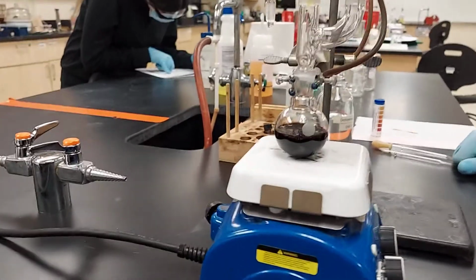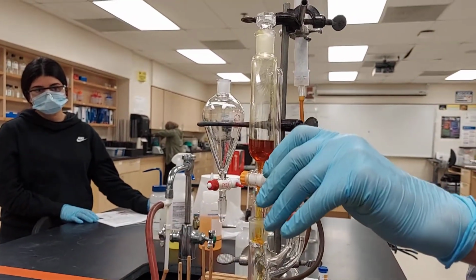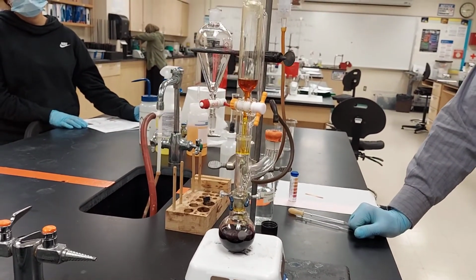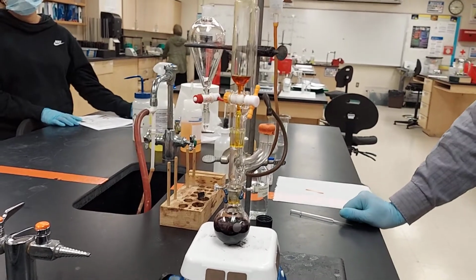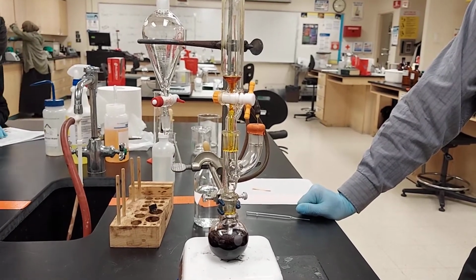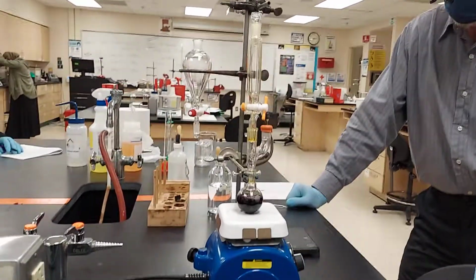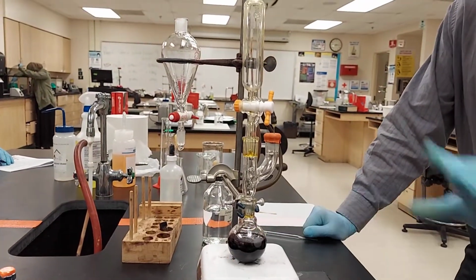So I think we're going a little slow here. This is not out of hand. We can speed up the proceedings a little bit. Oh, I'm getting bold here. That's a gush. Flask's getting kind of full. Maybe I should have chosen a larger flask. Ideally, you should choose a flask that only gets half full for a reaction. And I see some bubbling going on. It's not that warm, but it's definitely boiling.